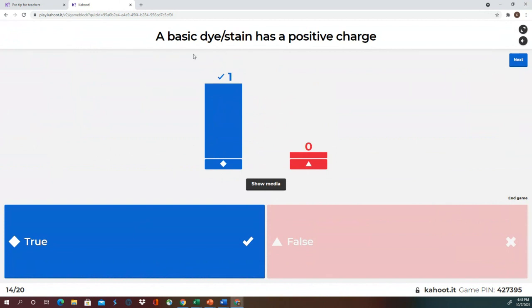And so because of this, a simple stain, which uses basic dyes, you're gonna have nice, brightly colored cells and a pretty white background, okay? Because the dye or stain is gonna be attracted to these cells. So the cells are gonna turn crystal violet or red if you're using safranin, whatever it may be. And so the background is gonna be bright white.